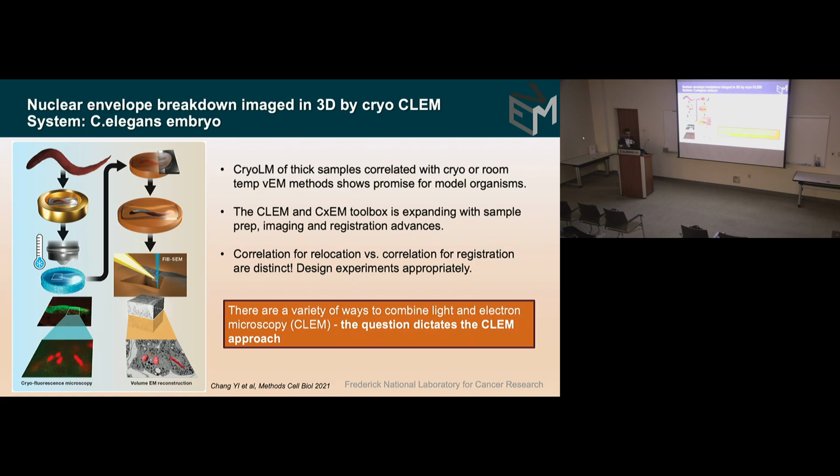Well, I was going to ask about the Drosophila data. So you didn't need high pressure freezing, so you have these sperm cells in PFA, but then that's going to fix that cellular process. So how does the timing work? So the way we did this was with high pressure freezing. Oh, so you did do high pressure freezing? We didn't. In the data that I showed you, it was done by conventional fixation, and we just have the power of numbers.